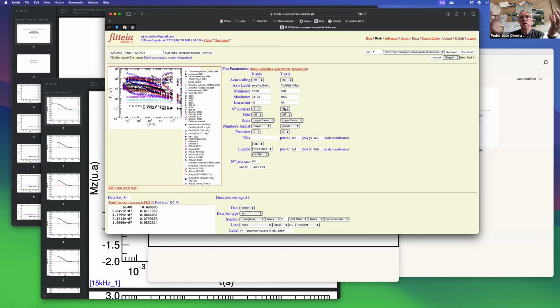Okay, we can say I make a representation of one of the T1s as a function of frequency, and I make another plot with the second relaxation time or rate as a function of frequency. So I have two profiles. The first question is: is the mixing factor constant for all the magnetization decays, or was the mixing factor free when you made the analysis?